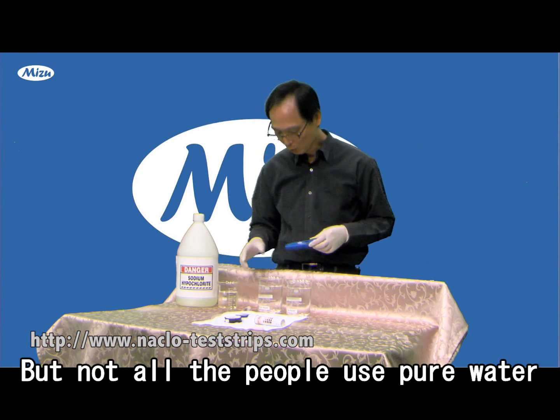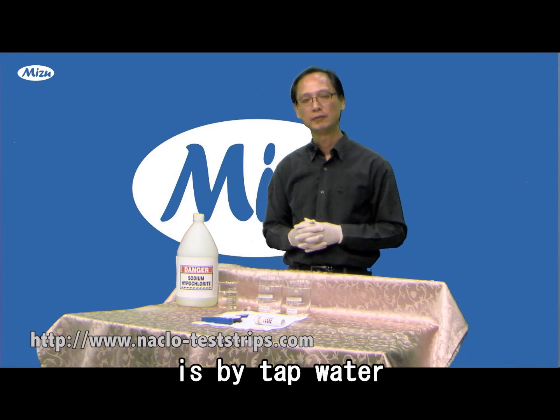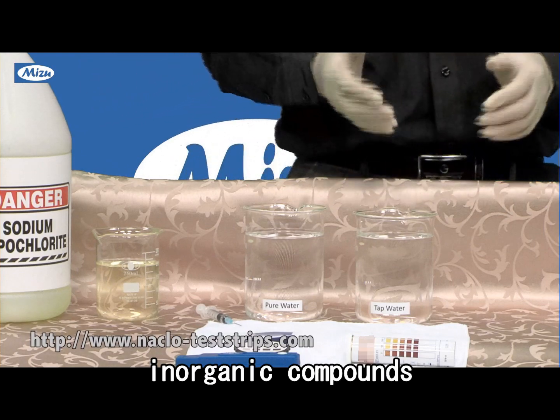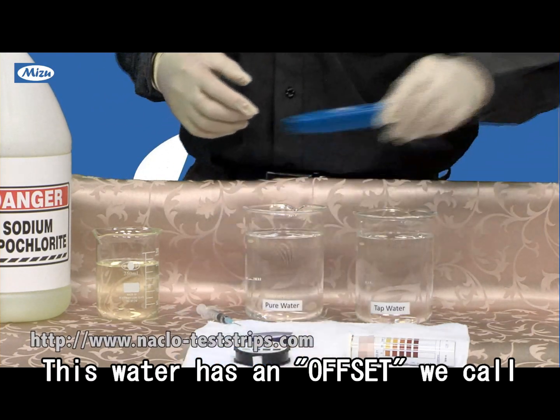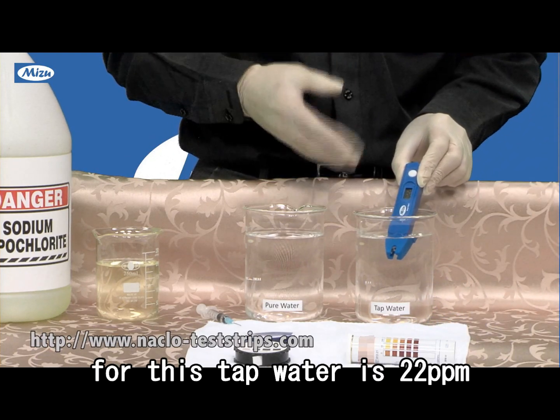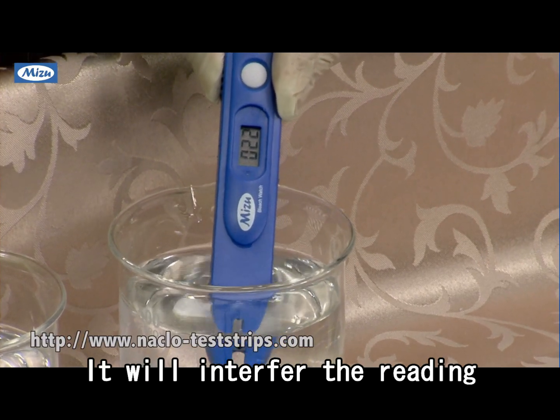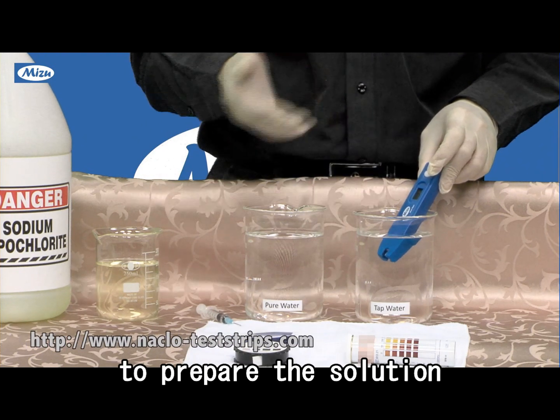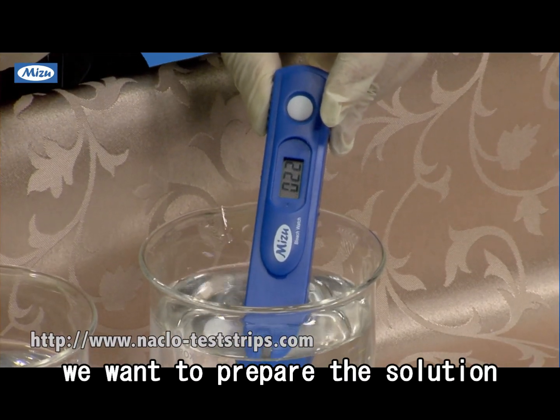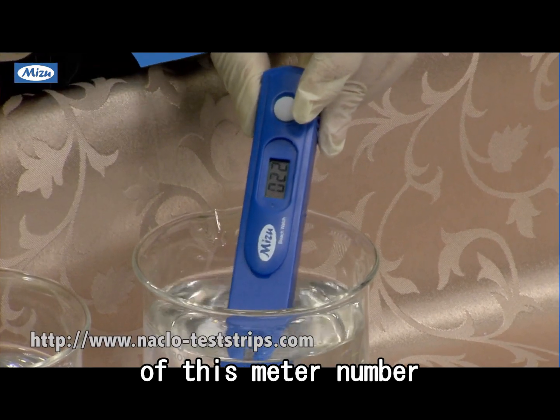But not all people use pure water to prepare the solutions. 99% prepare the sodium hypochlorite solution using tap water. Tap water includes a lot of mineral material and organic compounds, so this water has an offset — we call this the background number in the water. For this tap water it is 22. This 22 is already in the water and will interfere with the reading. So when we use tap water to prepare the solution, we need to subtract that 22. Let's say we want to prepare a solution for 500 ppm — so we should target 522 on this meter. I'll show you.